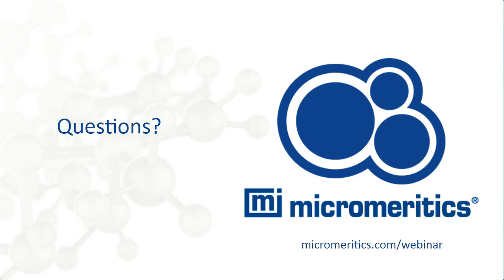The Dubinin, I must admit, I'm usually not using that often. So I'm not sure whether it's a good alternative. You see that with applying the criteria, the BET is frequently used for microporous materials, and the good thing is that with the Rouquerol plot, it's easy to determine the right range. As I said, it can vary for the different microporous materials. And as far as I know, the Dubinin is quite material dependent, so it's not a general method. But I'm not 100% sure, I have to admit.